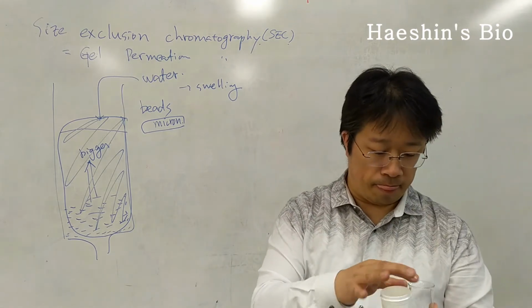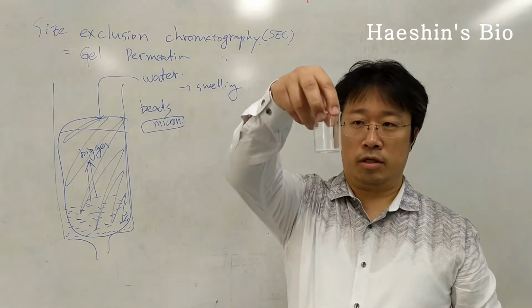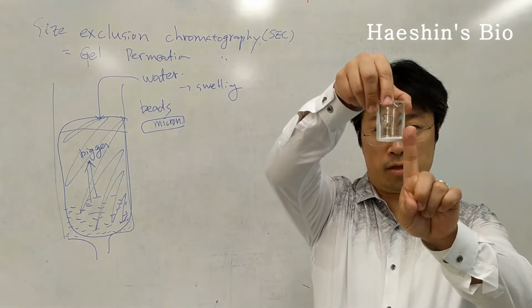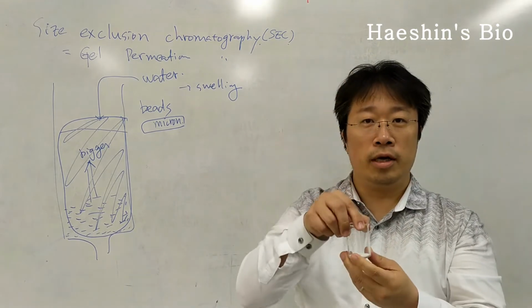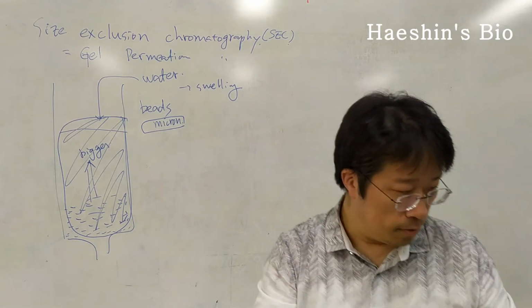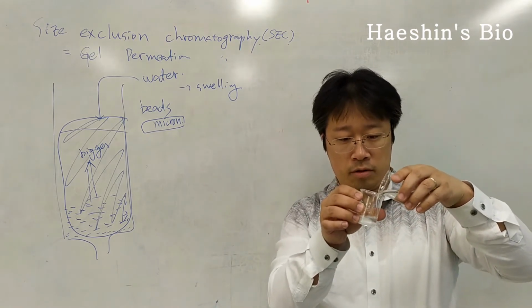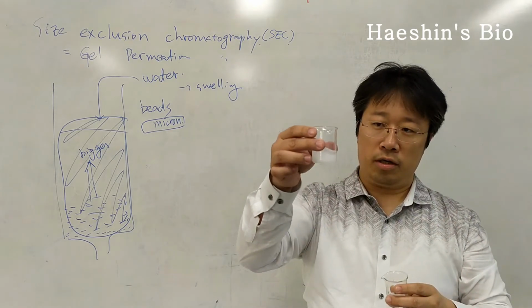Maybe you can see the height, right? The overall height is about 1 or 2 millimeters for me. Then I will put water into this powder. Here's water, and I put it in.